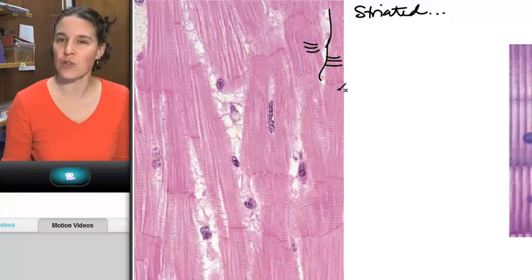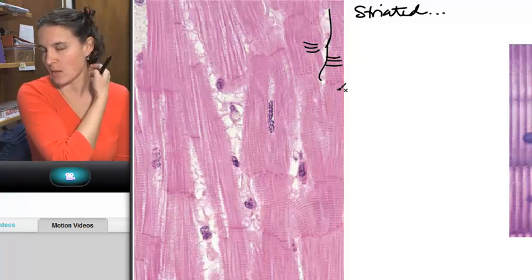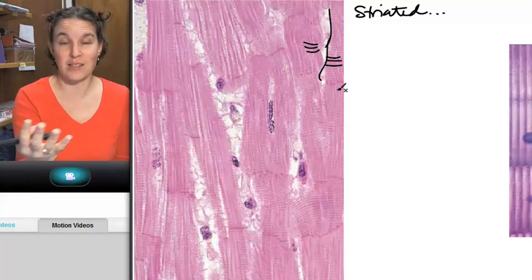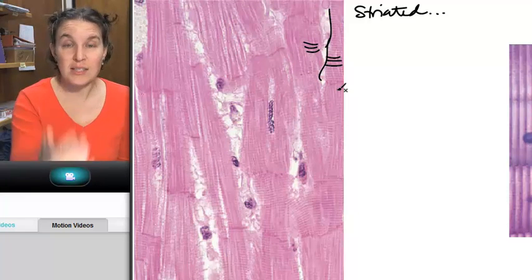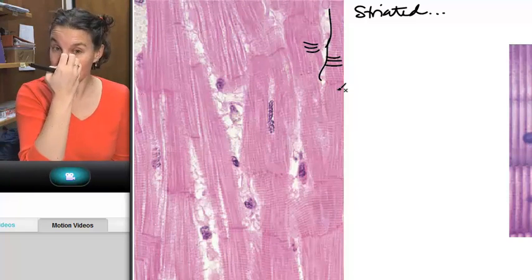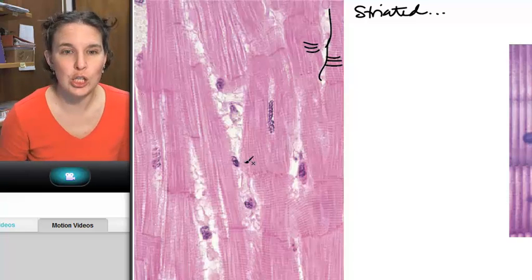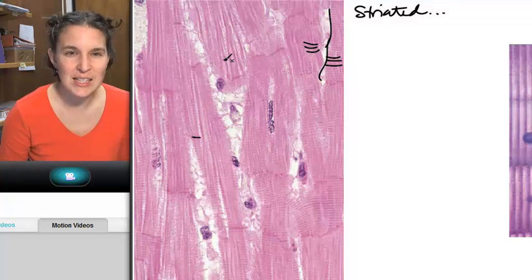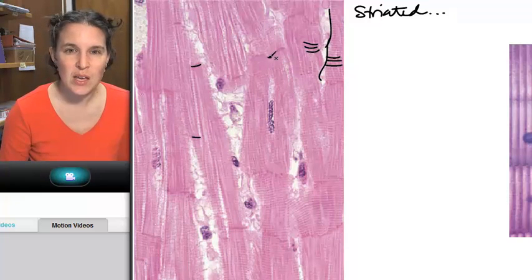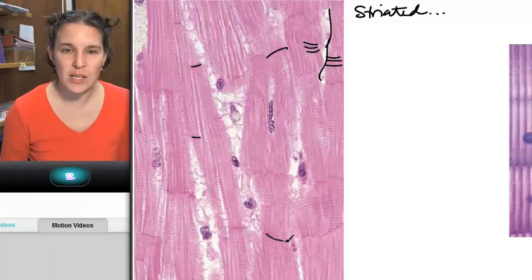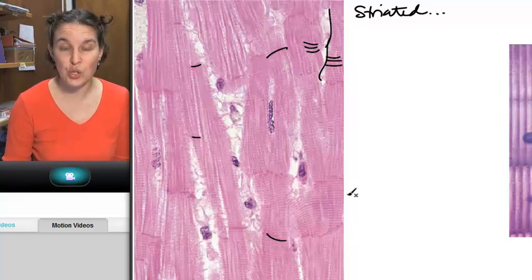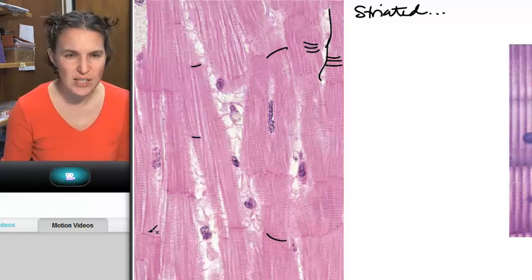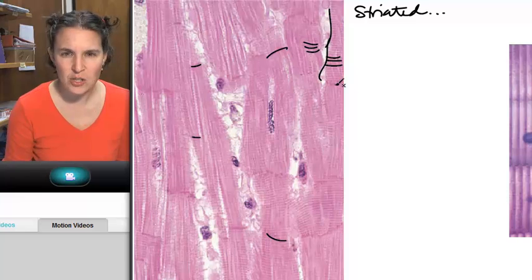The striations, if you're given a slide, the cardiac muscle is striated. Look, do you see these lines that you see in here? These lines are unique structures, unique to, these aren't striations. Do you see the difference? Here are my little striations, but then you end up with these interesting lines.